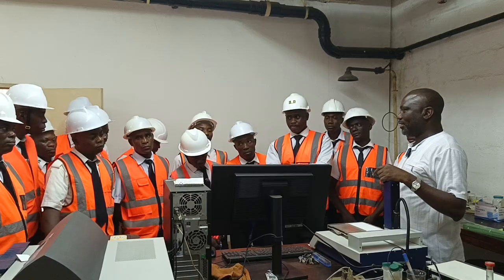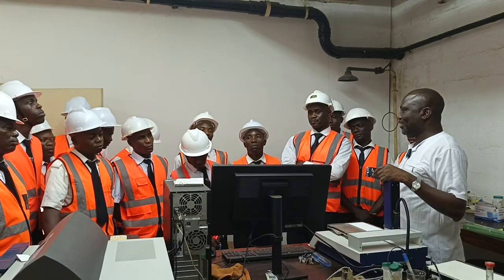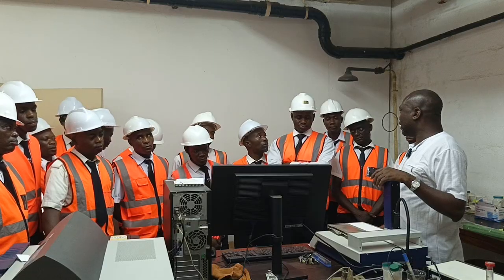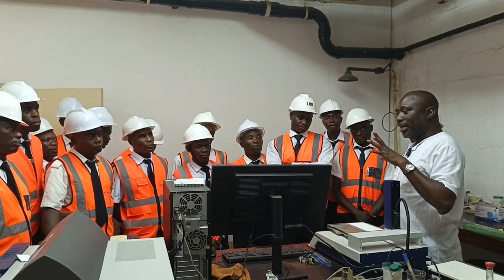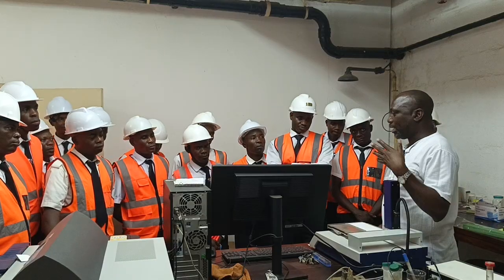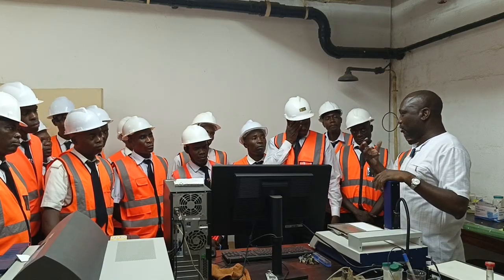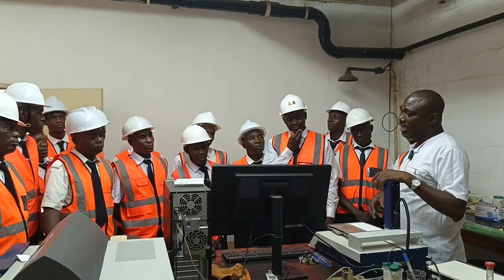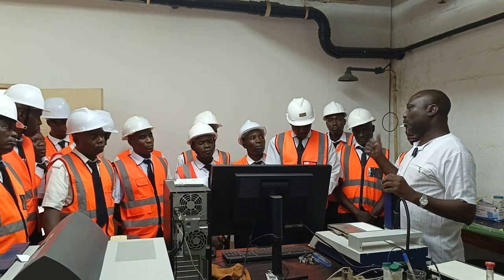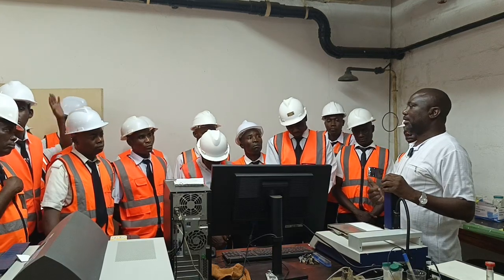Any questions? You have seen the two instruments that we have. They are used for many applications. We use it, like I said, with liquid samples, isn't it, which you can put here and which are able to move. We use it also in pharmaceutics.